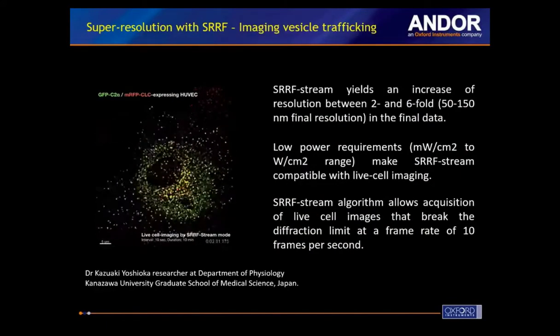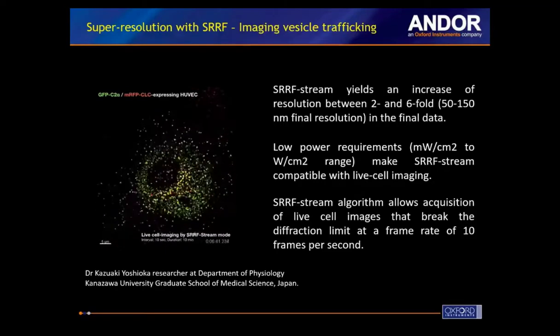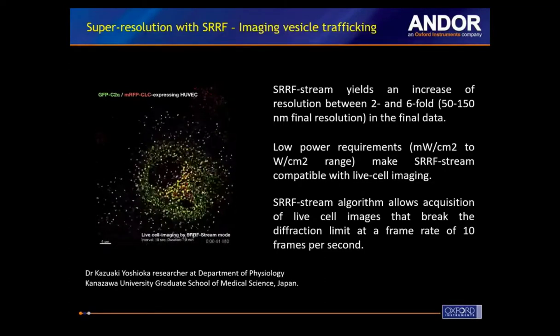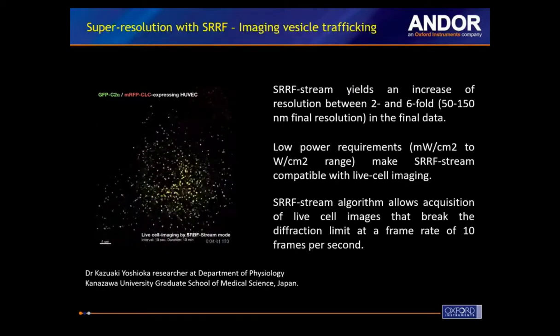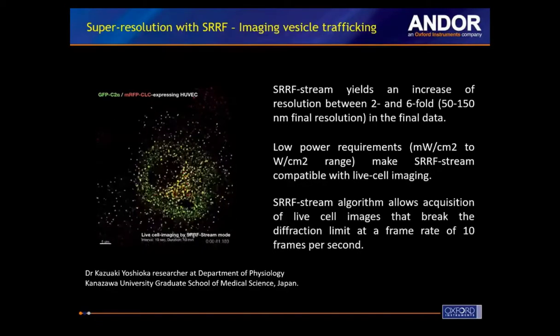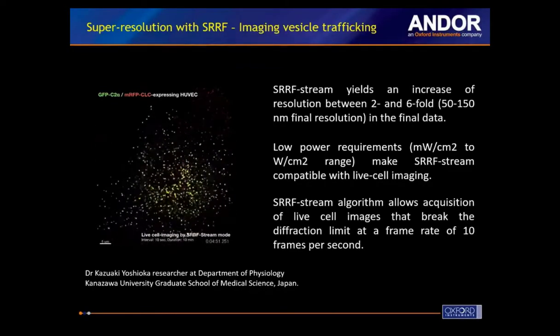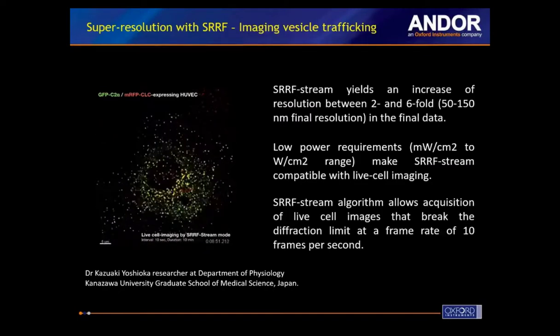SRRF yields an increase in resolution between 2 to 6 times more than conventional diffraction limited data, giving resolutions from 50 to 150 nanometers final resolution. The low power requirements that are needed to deliver a SRRF image make it compatible with live cell imaging.